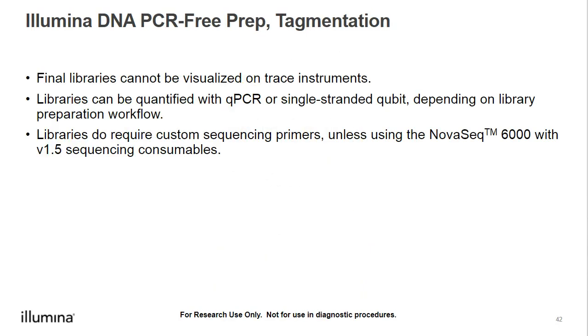Illumina DNA PCR-free libraries cannot be visualized with trace instruments like the bioanalyzer and fragment analyzer. We do provide size information in the reference guide from our molarity calculations. Final libraries are quantified with single-stranded Qubit reagents or qPCR.